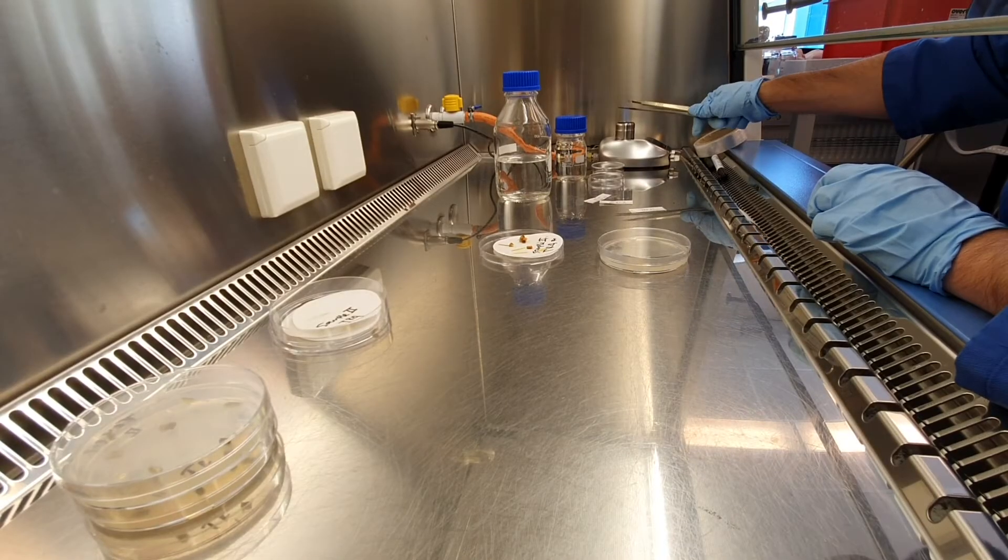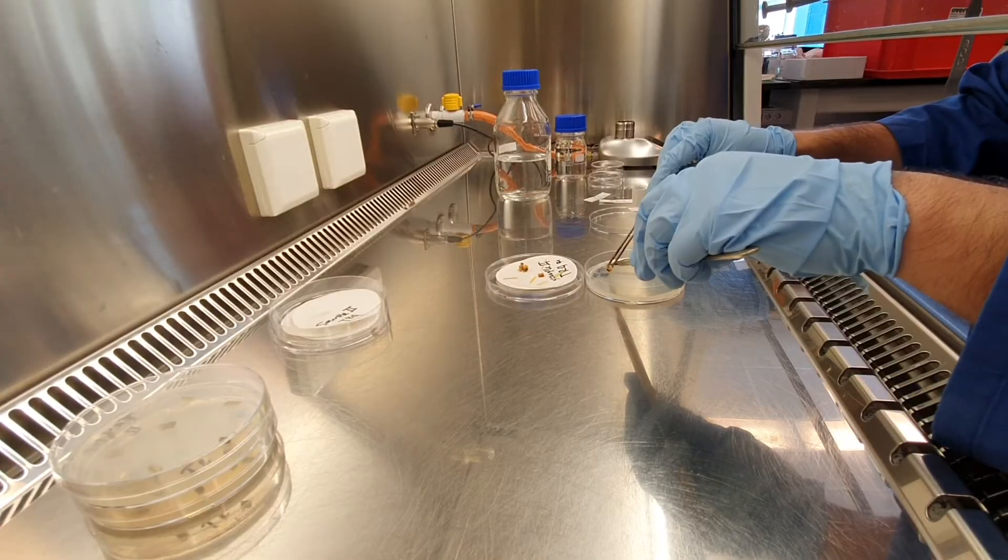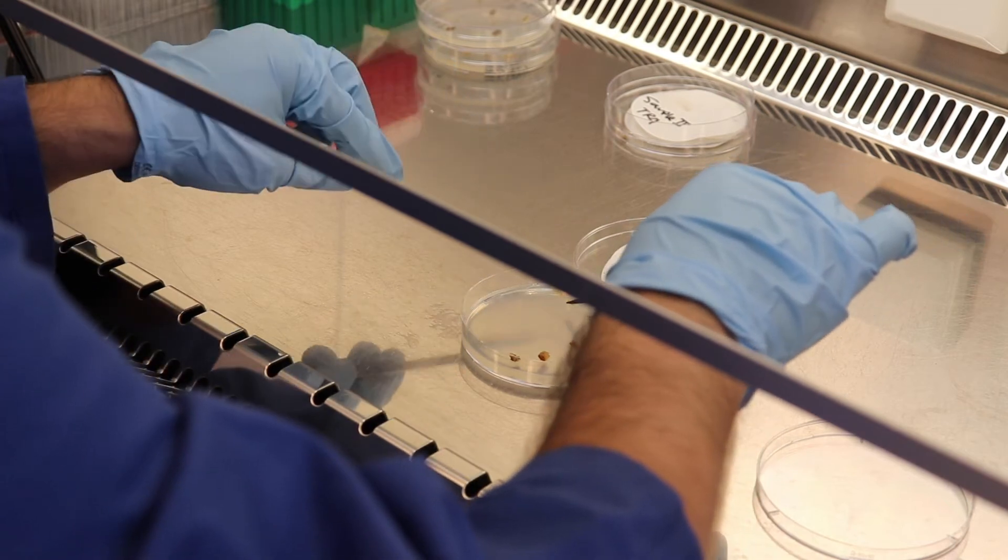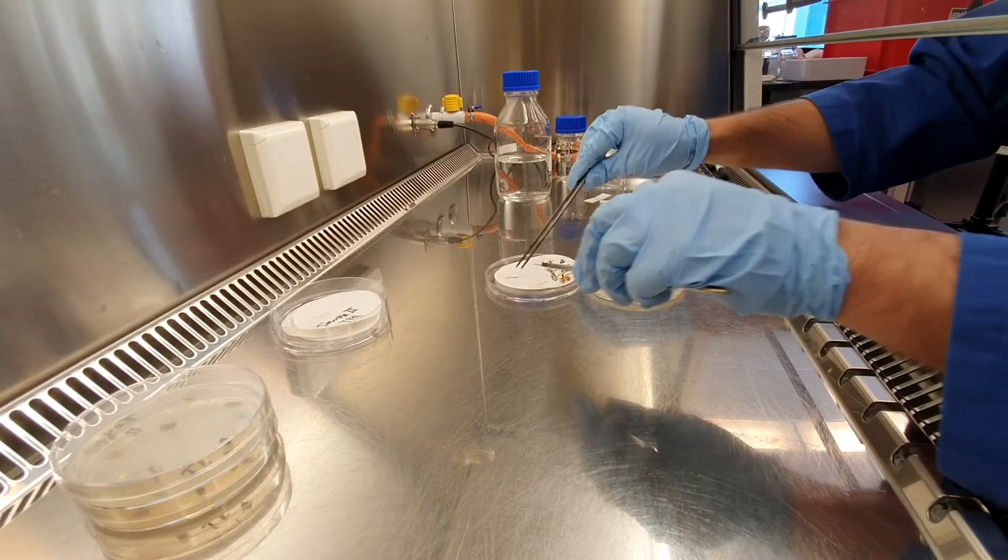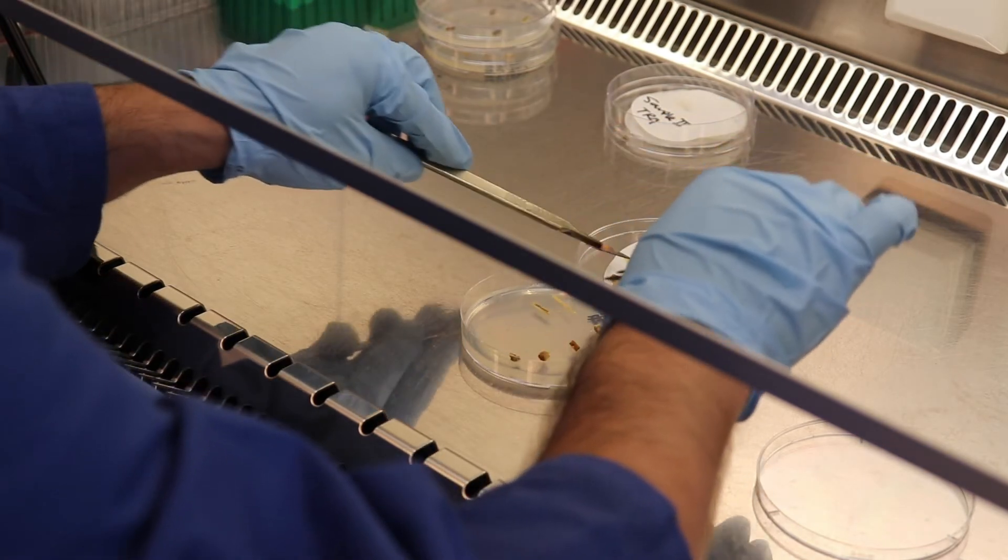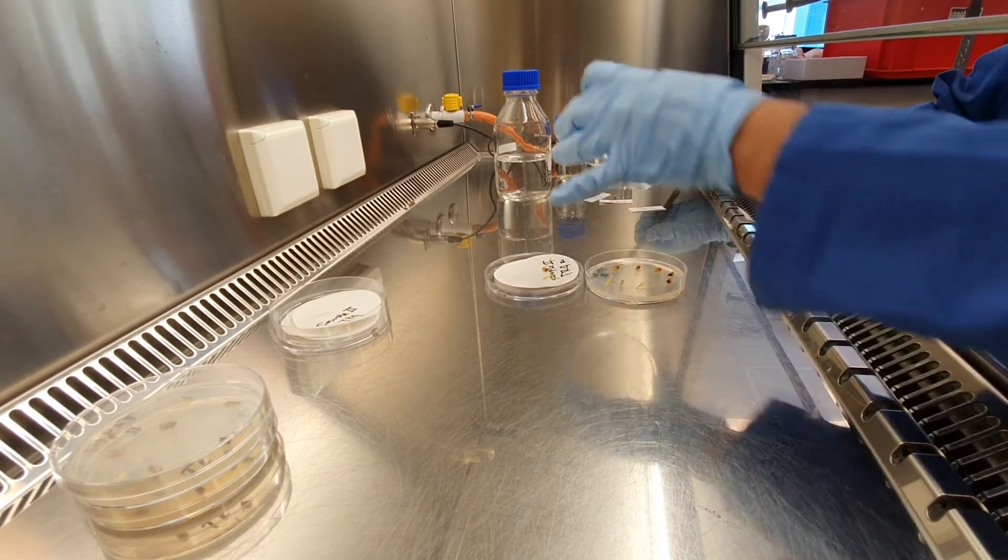And finally, sample three, the ugly one. As you can see, looks the same as the previous samples. I'm just placing the pseudostem in one side and the pieces of corm in the other side. That's it. Sample three.